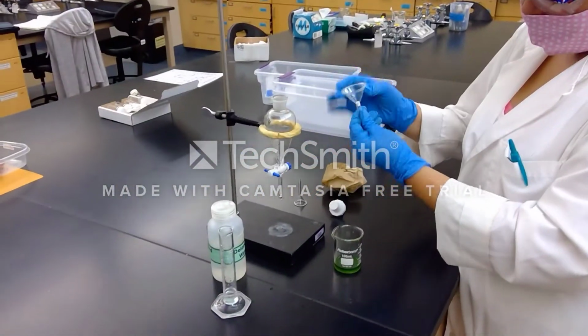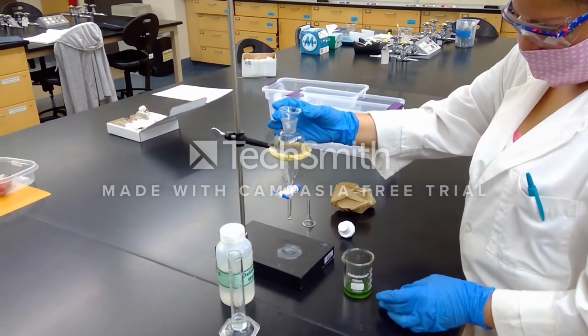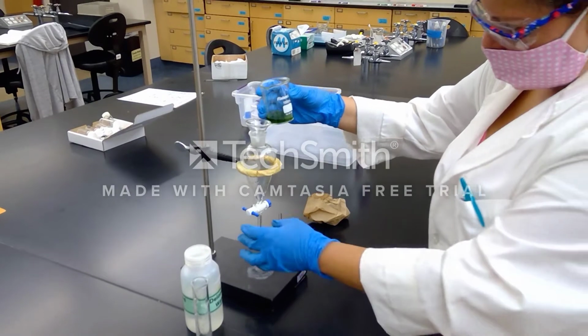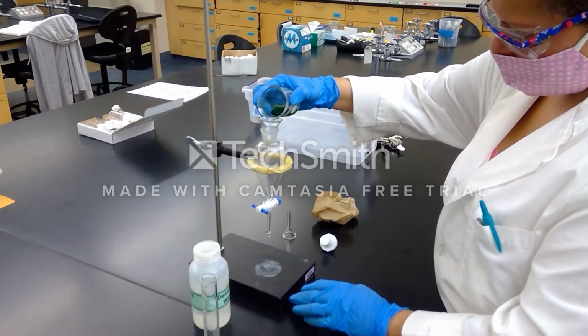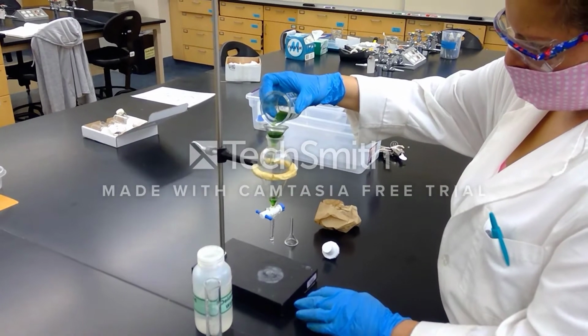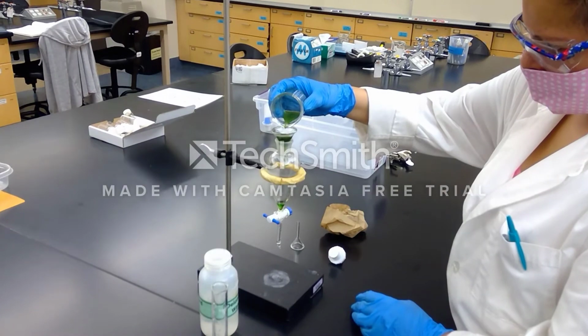Alright, so we have a glass funnel here with a small piece of cotton at the bottom to act like a plug. I'm going to go ahead and filter my extract here from the spinach leaves into the separatory funnel. So let's go ahead and just get all of our green into there. And this is so that we filter out any of the little solid particles from the extraction portion here.